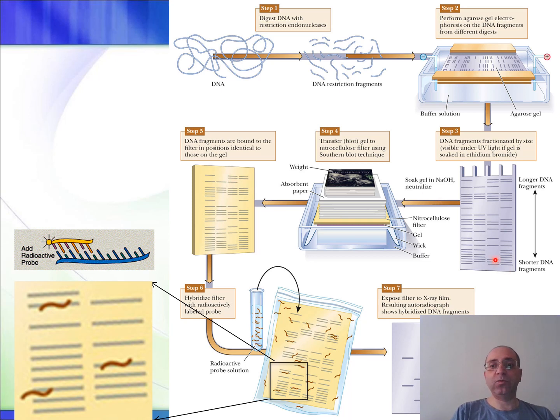You have the small ones right here. So basically, you have the small ones here, and you have the small ones also right here. So basically, the membrane looks like a replica of the gel. So you have the DNA fragments also organized according to size or length. So you have the large ones here, and you have the small ones right here, and everything in between.